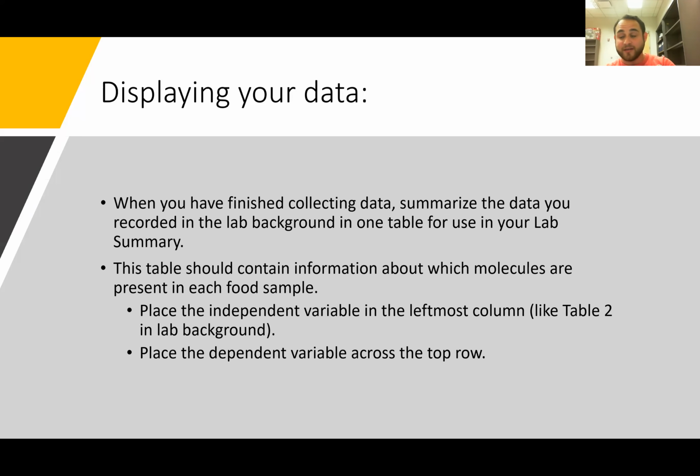Or vice versa. If I know something has proteins, what type of test should I do to see if it'll have proteins or not, and what is the positive color result for that type of macromolecule? So just please make sure you know the positive result color and what type of macromolecules trigger which type of test. But yeah, after that, you're done with the table, you're done with the experimental part.